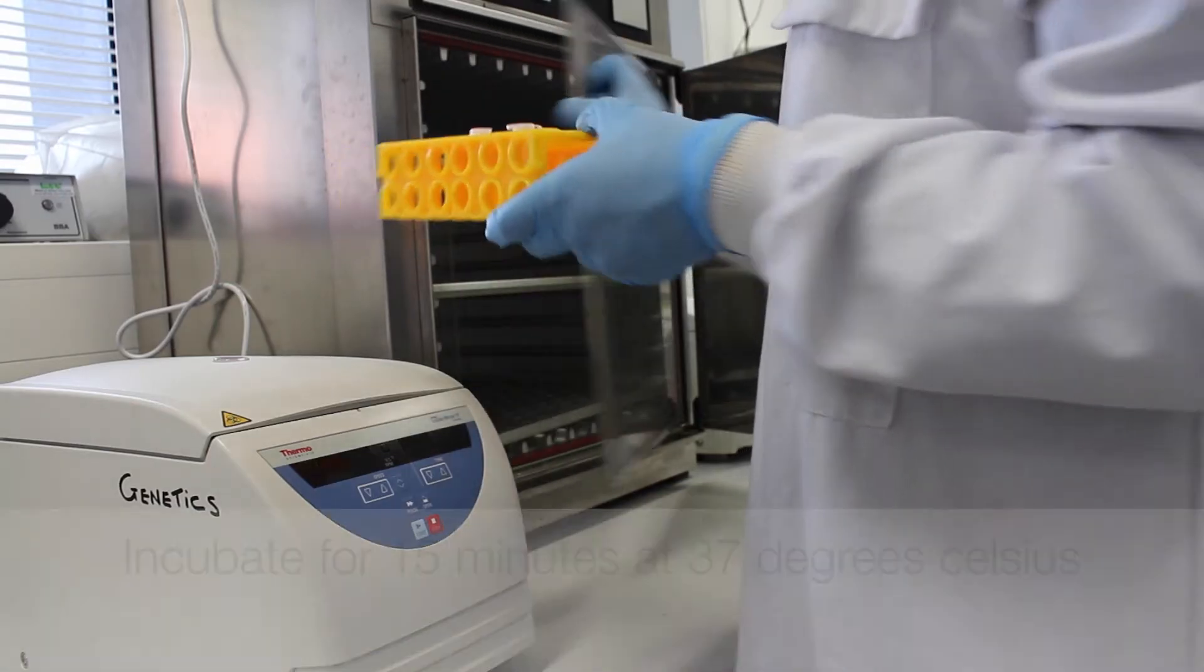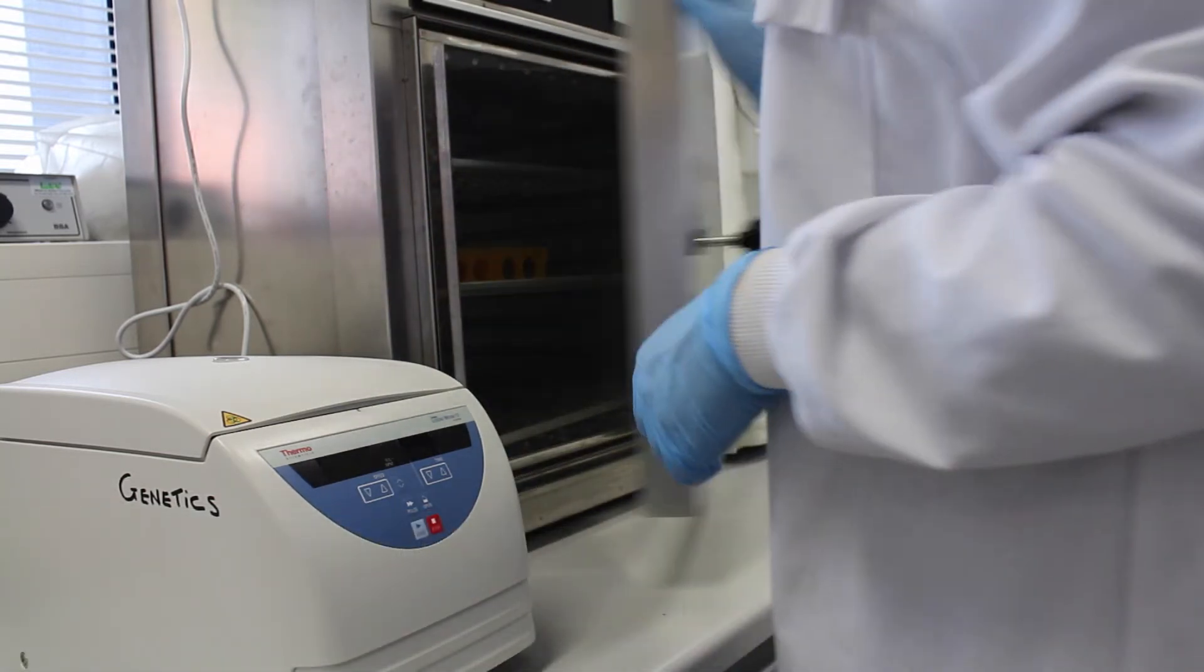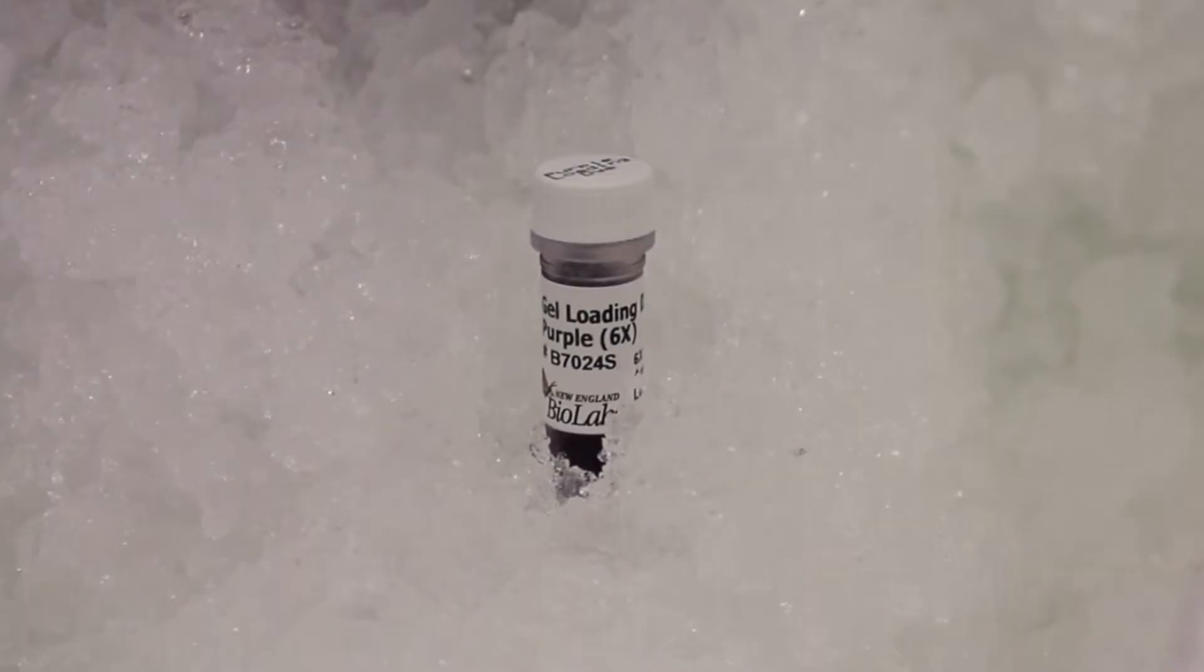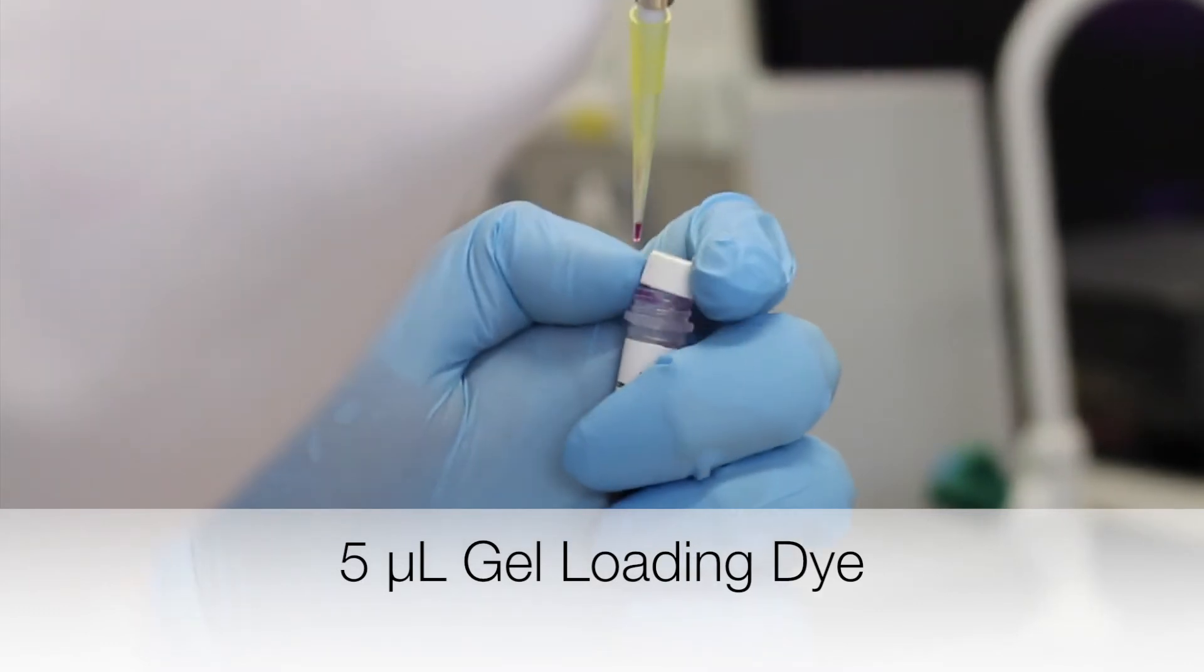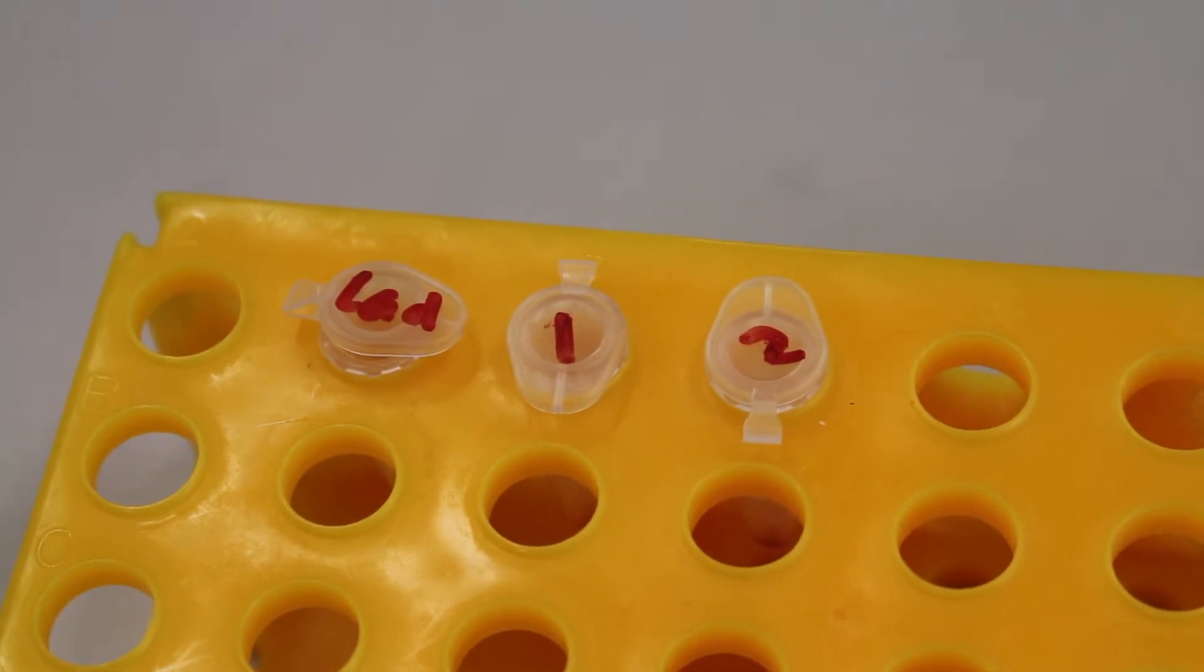The samples are left to incubate for around 15 minutes at 37 degrees Celsius. 10 microliters of DNA ladder is added to a separate Eppendorf tube. After the samples are removed from the incubator, 5 microliters of gel loading dye is added to each sample. Make sure that each tube is properly labeled. The samples are ready to be run on the gel.